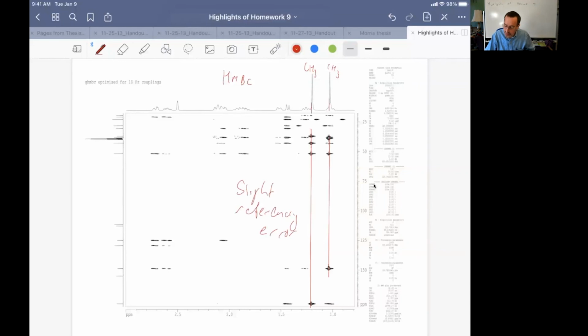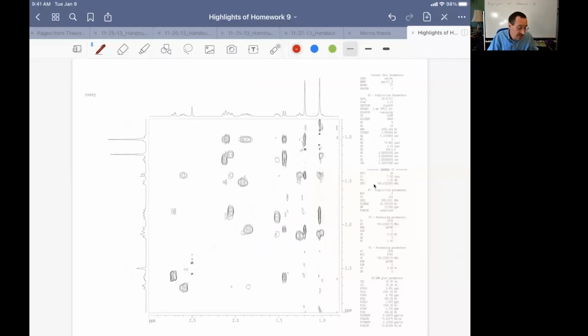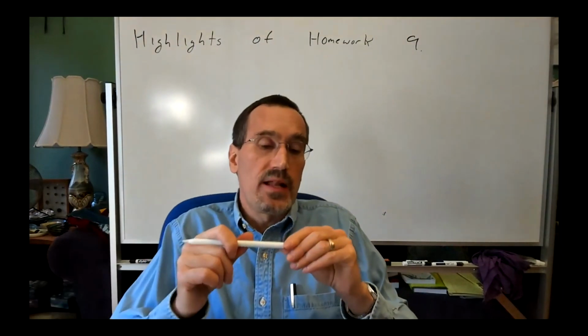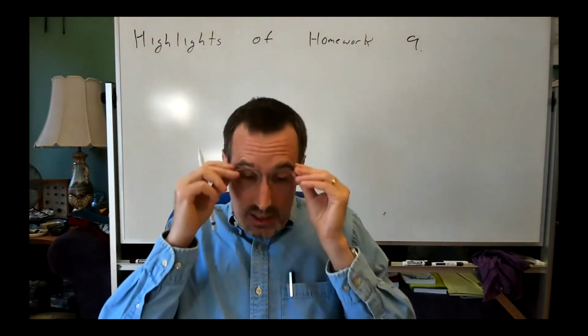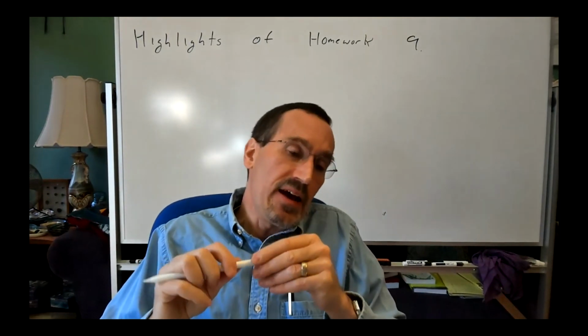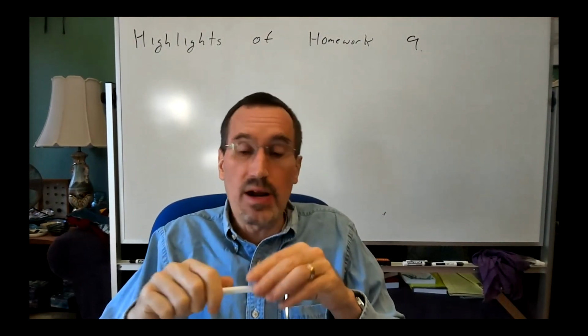So we could have gone back and done that. And again, you'll be able to very nicely pick out your cross peaks off those isolated methyls to assign them in the HMBC. And I think here's the NOESY, and I don't really have anything special to say about that, except that it'll be useful for figuring out your stereochemistry and conformation of the molecule. So that's a highlight of the 5 problems that you're going to have for this weekend. Any final questions on the 5th problem?